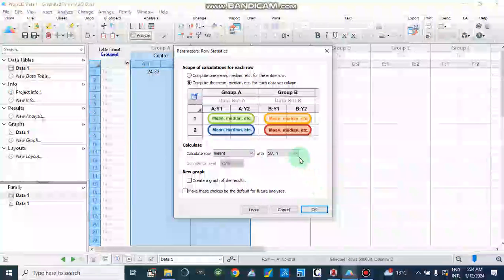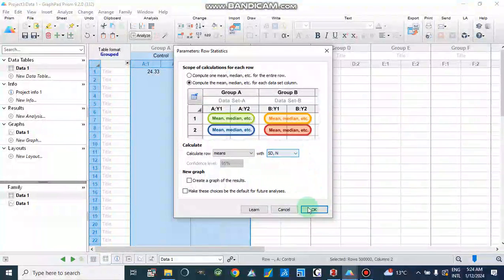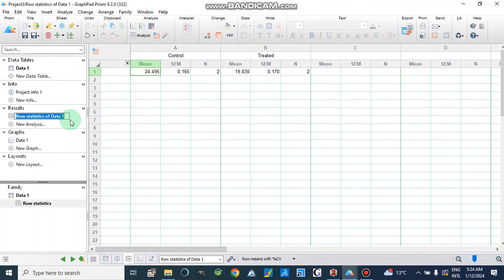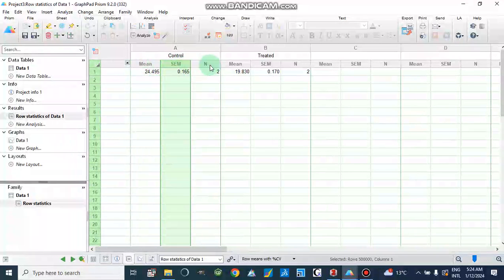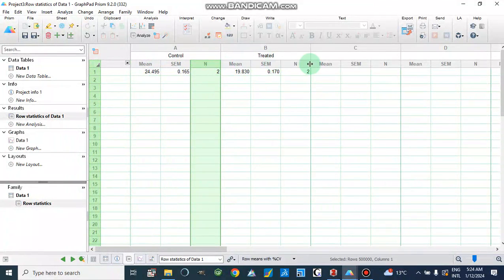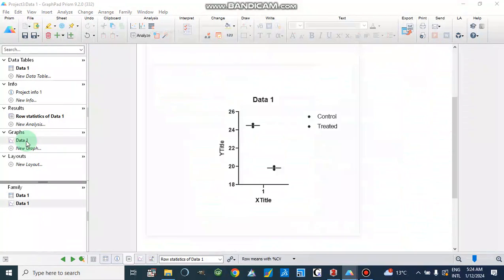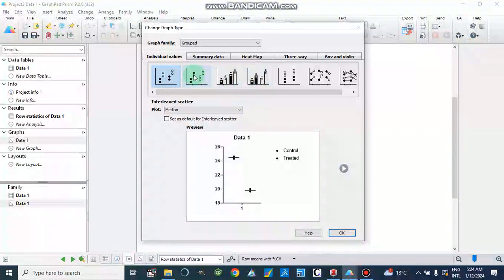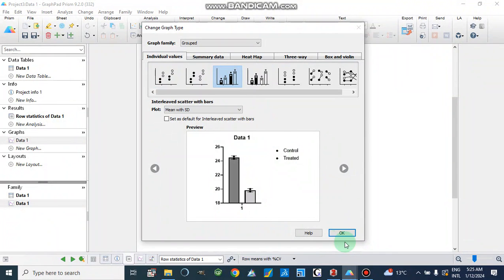If we want to make this data with standard deviation we can select that, or if we need standard error of mean we will select standard error of mean and click OK. The row statistics results appear in the results section showing mean of control, standard error of mean, and two replicates. Similarly we have mean, standard error of mean, and two replicates for the treated group. We will now make a graph from here.